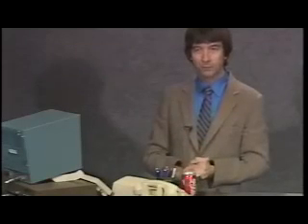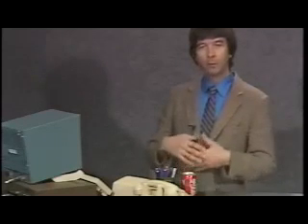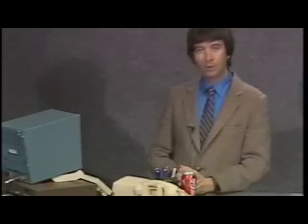Now, the reason the field ion microscope is so powerful is because the only kind of image simulation that you need is essentially something as simple as this. But to give you a feeling for what a field ion microscope image actually looks like in real time and how well it reproduces this model, I have a videotape which was taken during real time imaging of one of these surfaces. The surface is a BCC metal, tungsten, and we've imaged it in the field ion microscope by putting helium gas into the microscope and applying a high voltage and just seeing what happens.